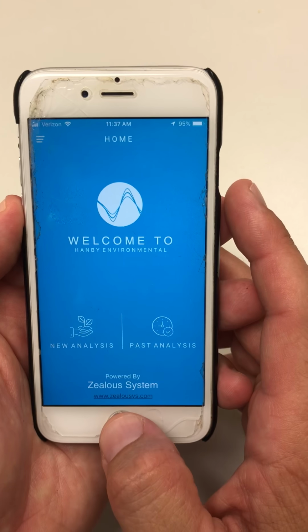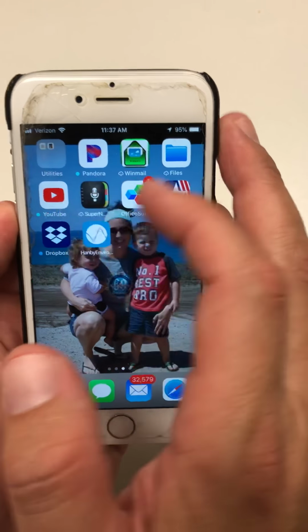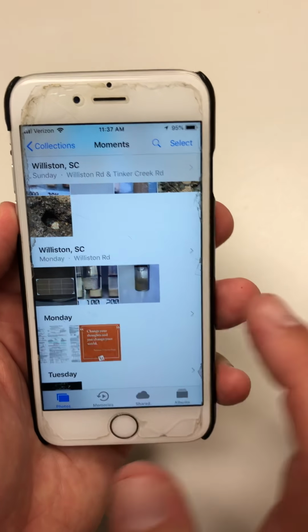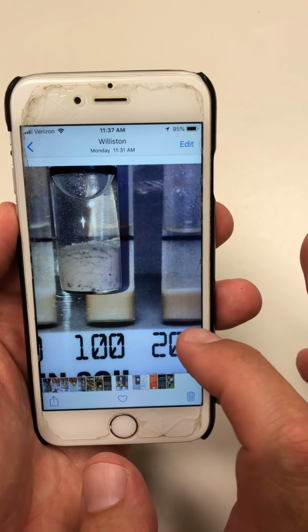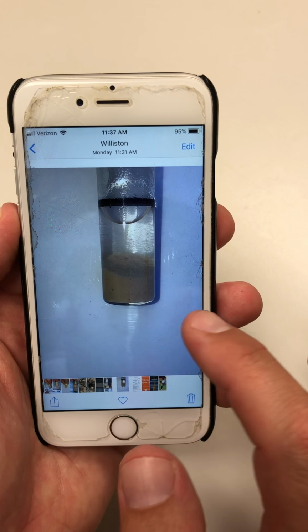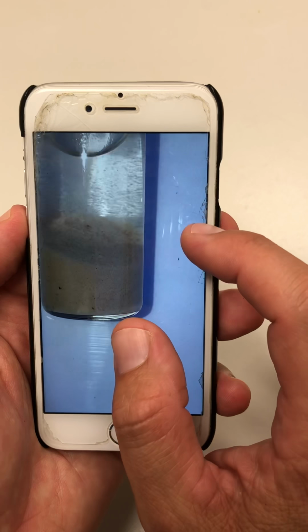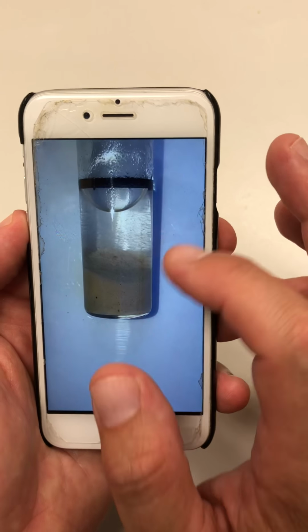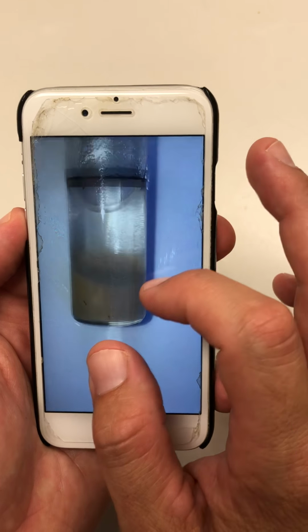I want to go back to my camera roll real fast to show you guys an example. Remember, this is what we just used. This was our preliminary judgment call photo. There was our sample image against a white background. I want to focus in on the fact that, the question comes to light, this appears just slightly darker than it really is.